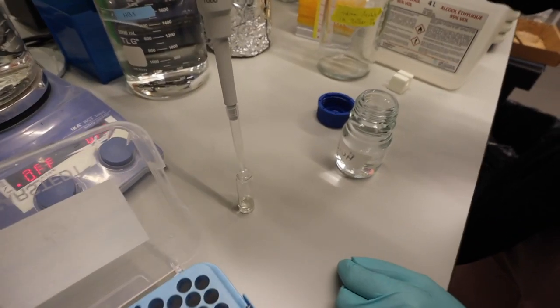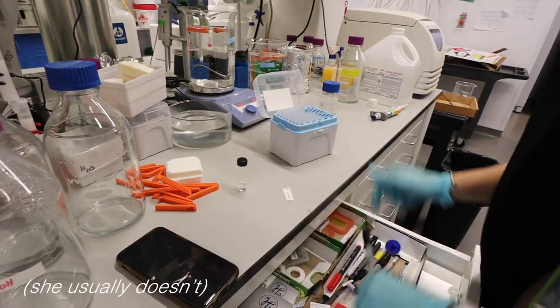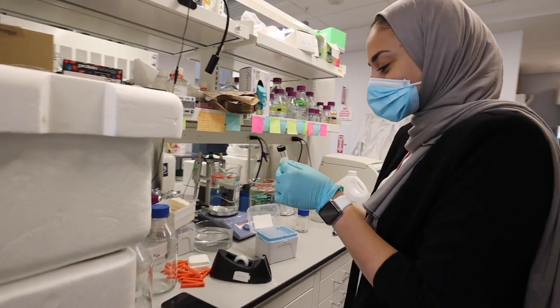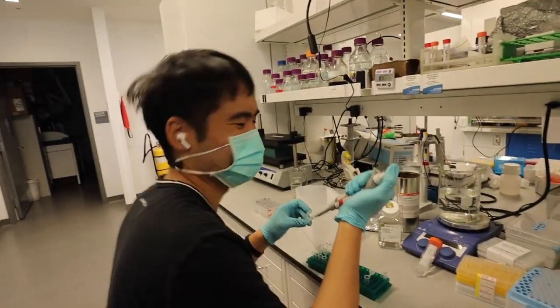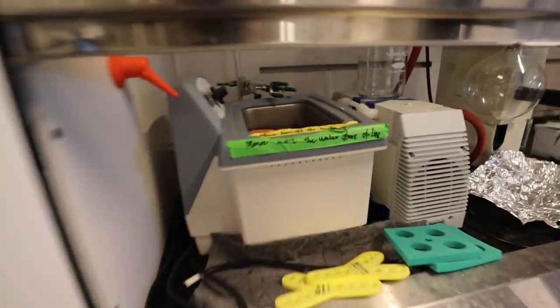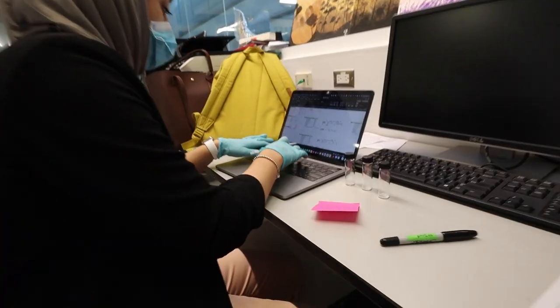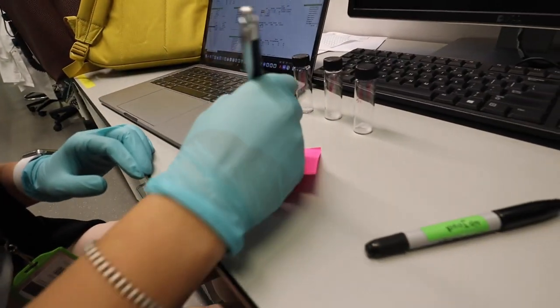Now she's adding ethanol. She's labeling for the sake of professionalism. This is the level of expertise you have - you can just tell the difference between all the clear solutions. We're going to sonicate it in the sonicator now. How long do we sonicate it for? Does it matter?